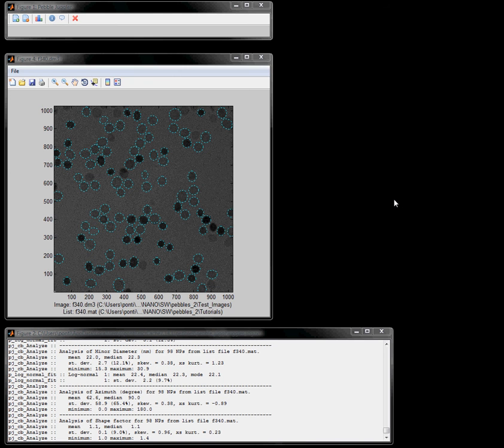Hello, in this tutorial I'll show you how to treat plurimodal distributions in PebbleJuggler. Plurimodal distributions are distributions which have more than one local maximum, more than one peak, and I'll show you how we can try to disentangle this plurimodal distribution into single monomodal distributions.